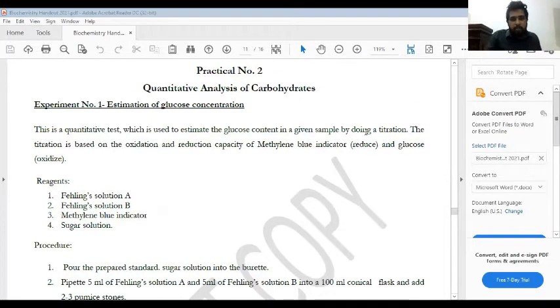About the pH range of the previous experiment: when we do the enzymatic hydrolysis, the favorable pH is about 5.6 to 6.9. In the previous experiment, we don't need to provide that pH. Actually, that pH cannot be there because we did acid hydrolysis. I just mentioned the enzymatic hydrolysis. Nilesha Jarap, what's your question?